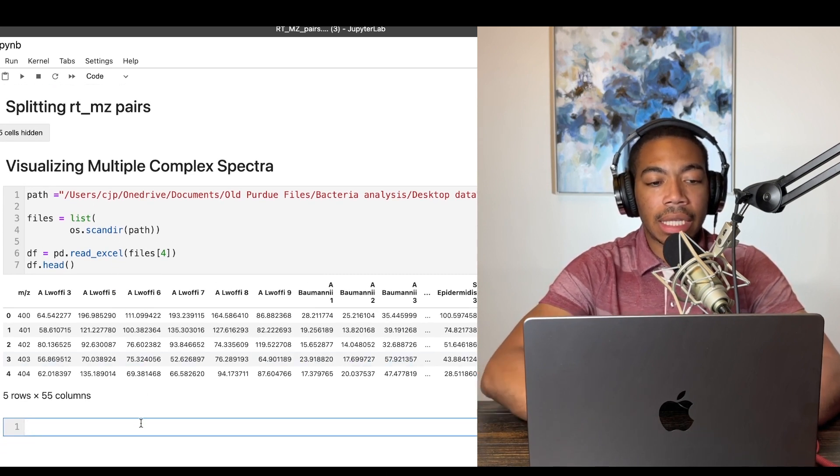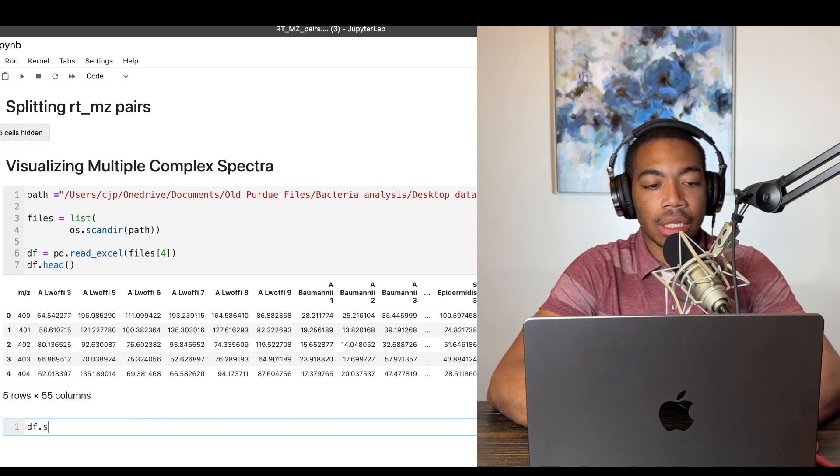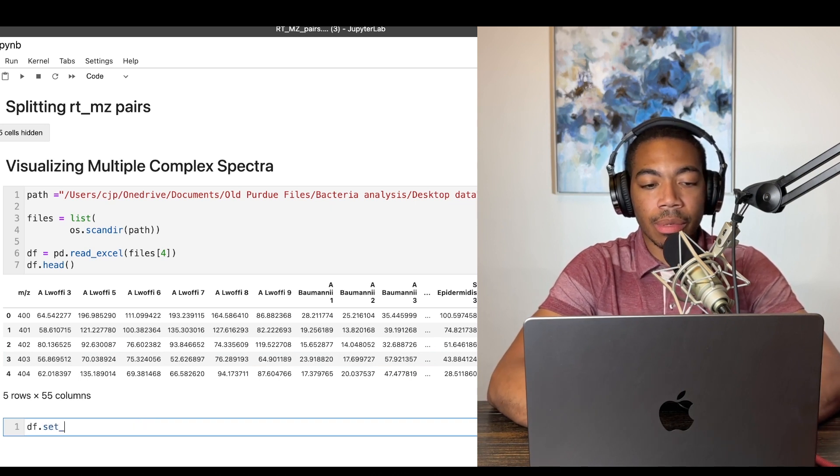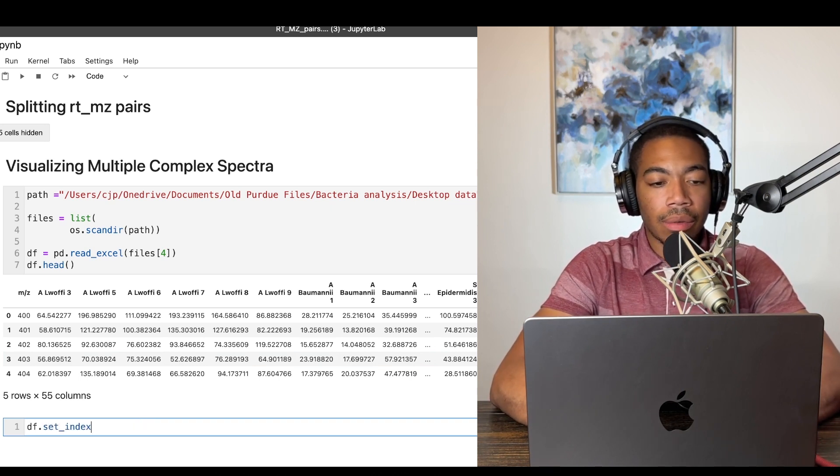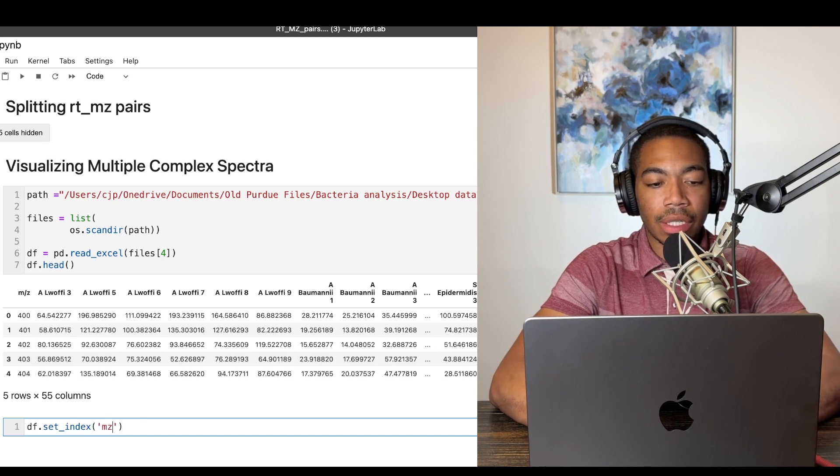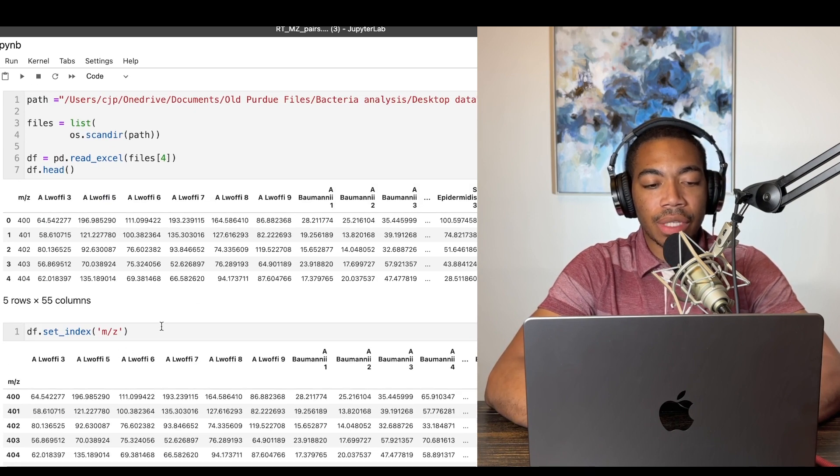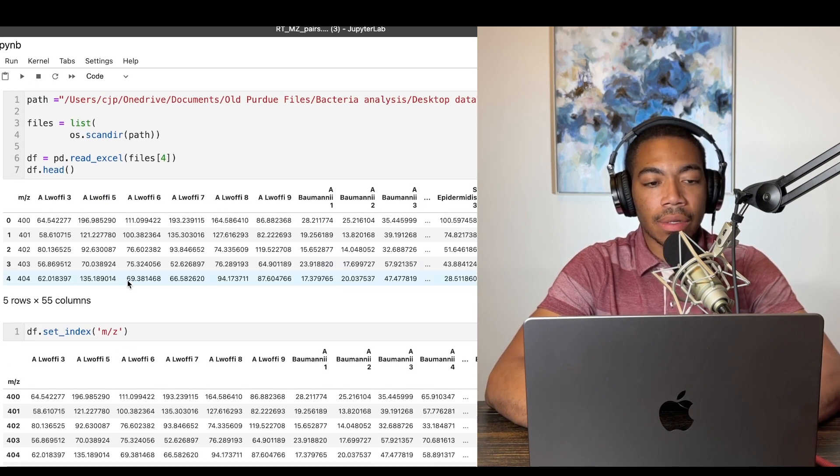And so let's say we've got a data set that looks like this. And I want to clean it up first by setting the index equal to m/z. And so now we have our m/z as our index.